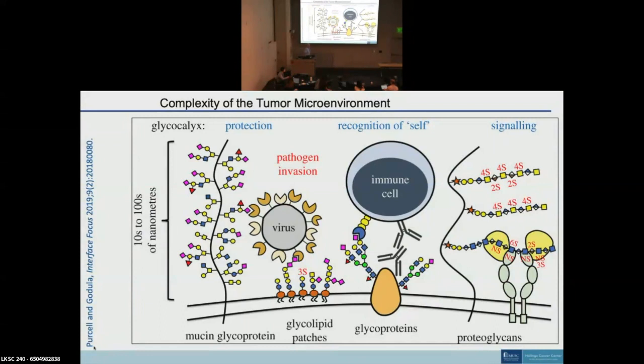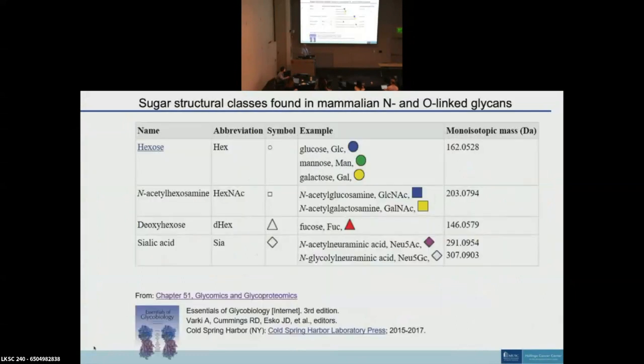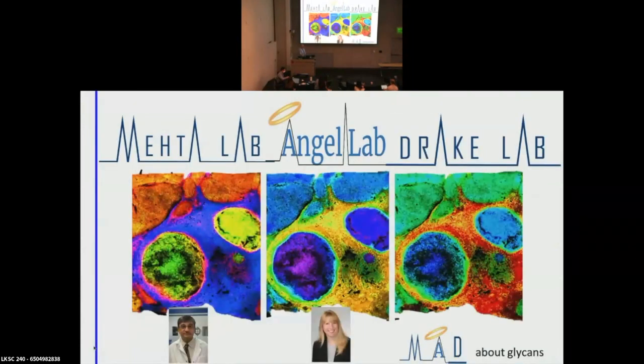Well, the N-linked glycans right here. In humans, there's 7. We use these little cartoons to define these sugars that get combined in many ways. There's other ones in the other conjugates for N-linked. There's 7. If you're a mouse or not human, you get 8. You get a funky N-glycolylneuraminic acid version, NeuGc. We can pick those up pretty well too, but I don't think I've got any mouse studies today.